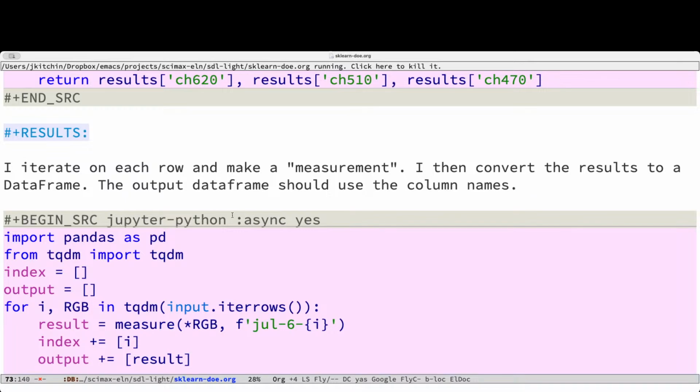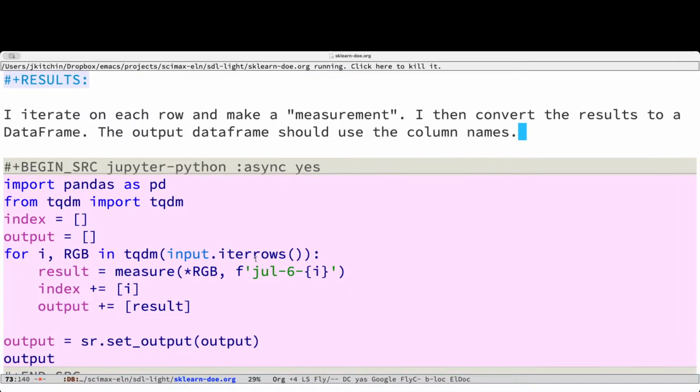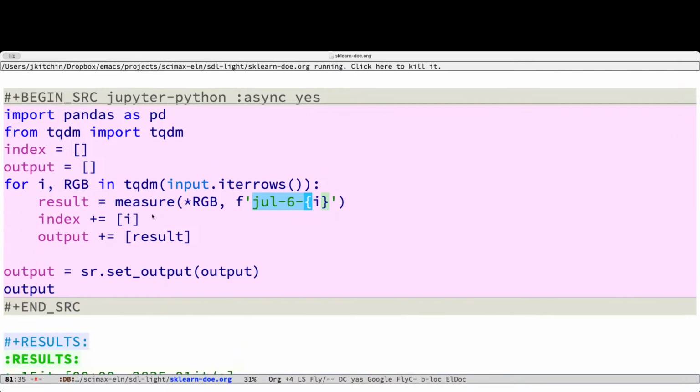Okay, to run these, we just iterate over the rows, and you can see here I started this post 2 days ago, so it's taken a while to actually write that surface response class and fine-tune it and test it and add things to it. And let's see, in here I think we can get rid of this index now, so I'm going to get rid of that.